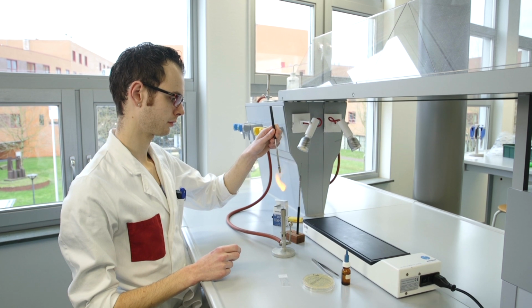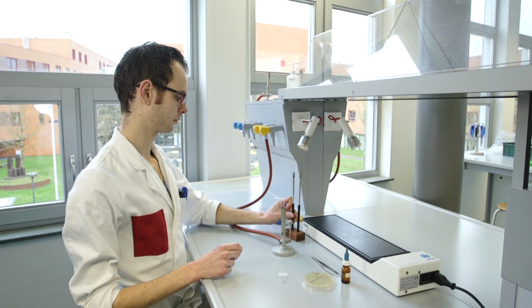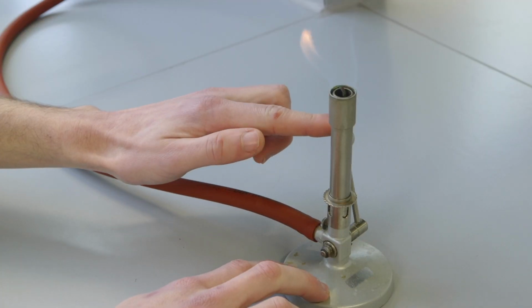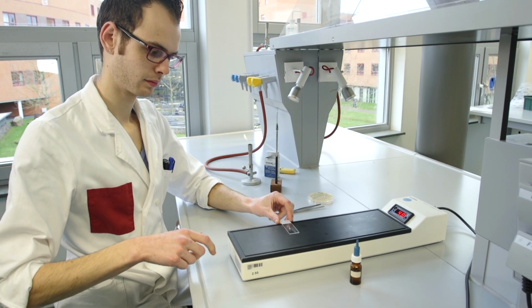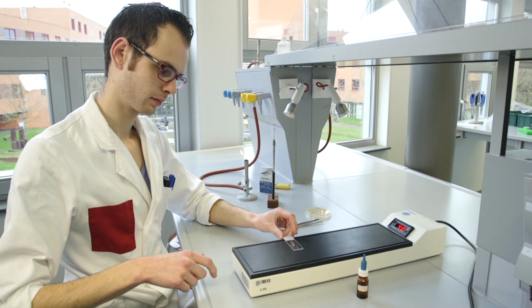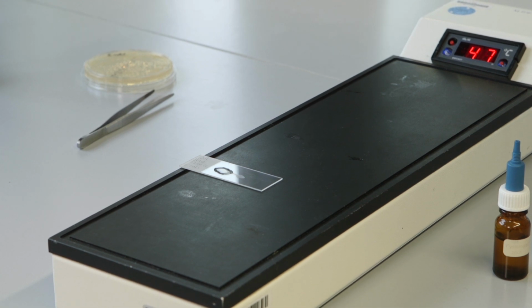It is also possible to make a gram stain from liquid culture instead of from a colony. In this case, you don't have to resuspend the bacteria, but can start from the following step. Now let this slide air dry at room temperature or on a slide dryer at about 45 degrees Celsius.